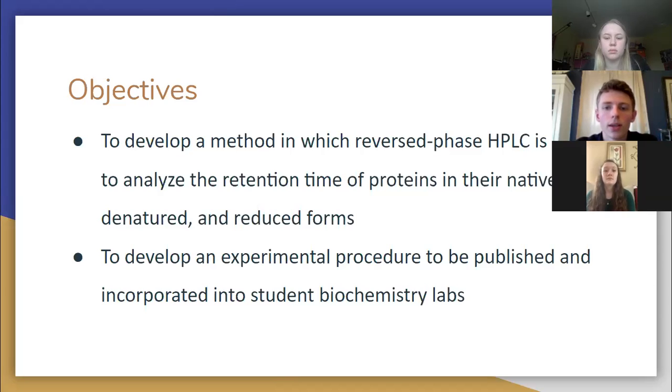Through the use of reverse phase HPLC with a C18 column, different conformations of lysozyme were analyzed this spring. With a lysozyme protein, when it's in its native conformation, it has exposed polar surfaces, giving a lower affinity for the column and the shortest retention times. The proteins are partially unfolded from different influences. They expose parts of their interior hydrophobic residues, allowing them to have longer retention times. When the protein is fully reduced and is completely unfolded, lysozyme has the longest retention times in the column.